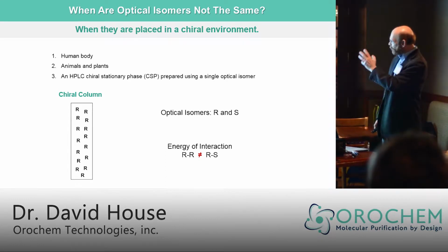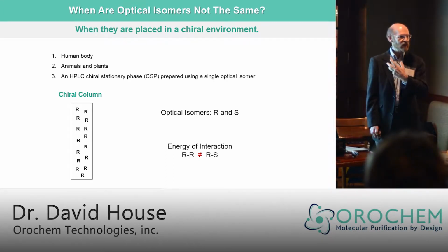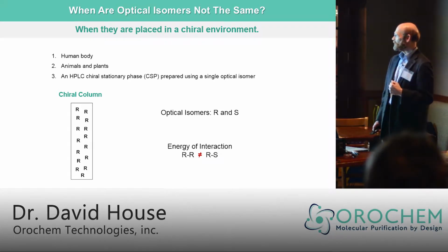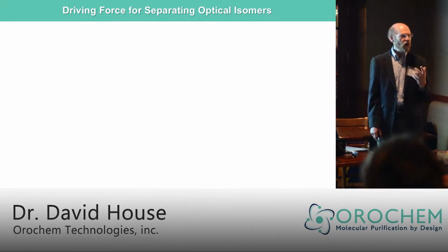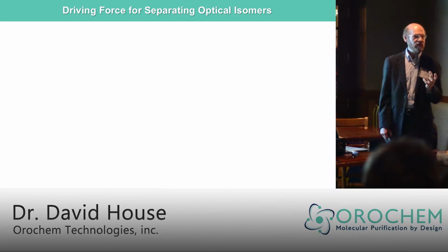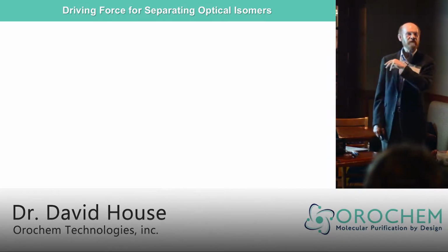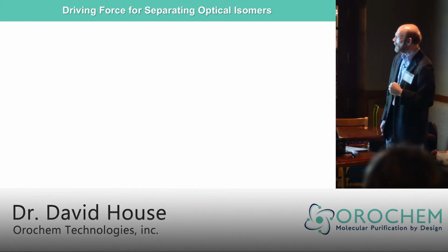This is the type of interaction that we'll be looking at with the molecular modeling when Ben Wu gets up and gives that part of the presentation. Now, there's a strong driving force for purifying optical isomers. And I have just 4 examples here. There are many examples in the market.